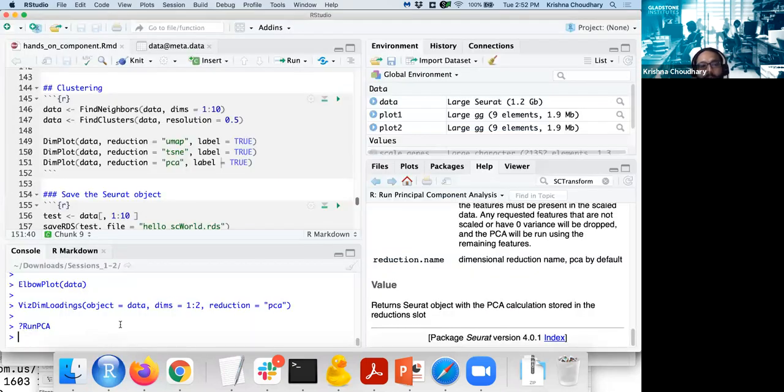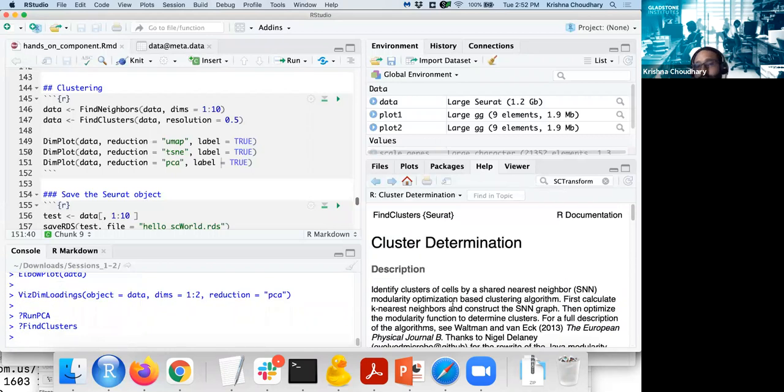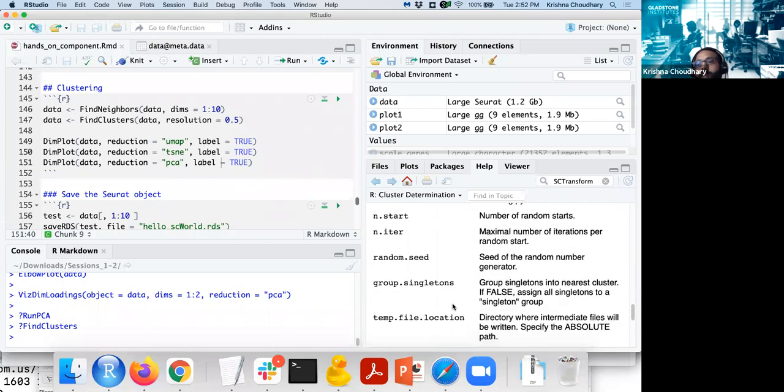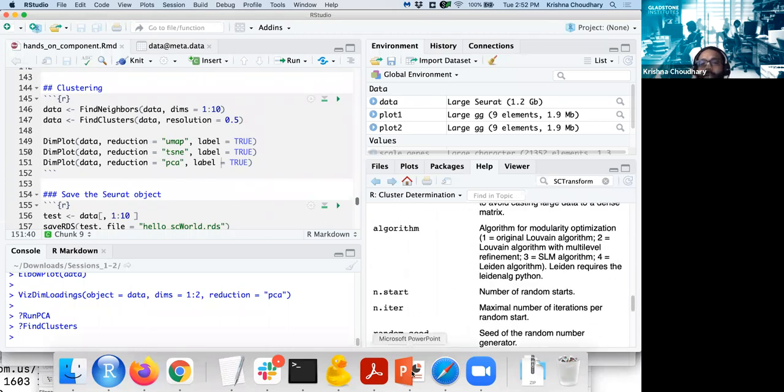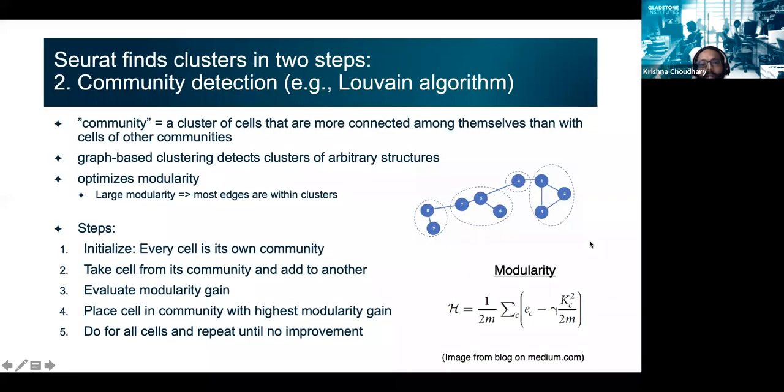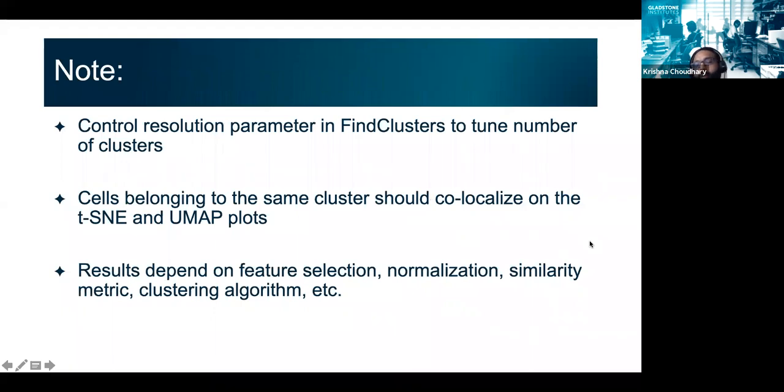In Seurat, there are several clustering algorithms available. Louvain is the default choice, and in practice, it works well. People have raised certain concerns about Louvain, but I think they may not be so serious a concern in single cell biology. That's why Louvain remains the default still.